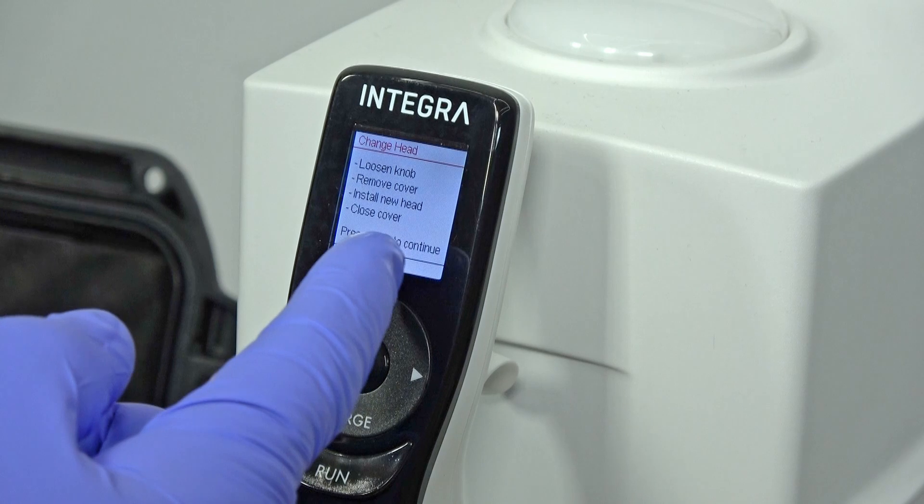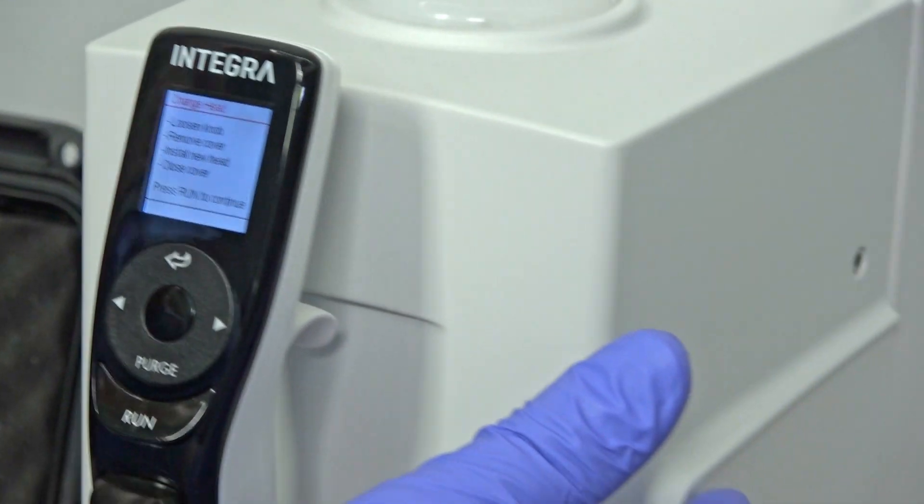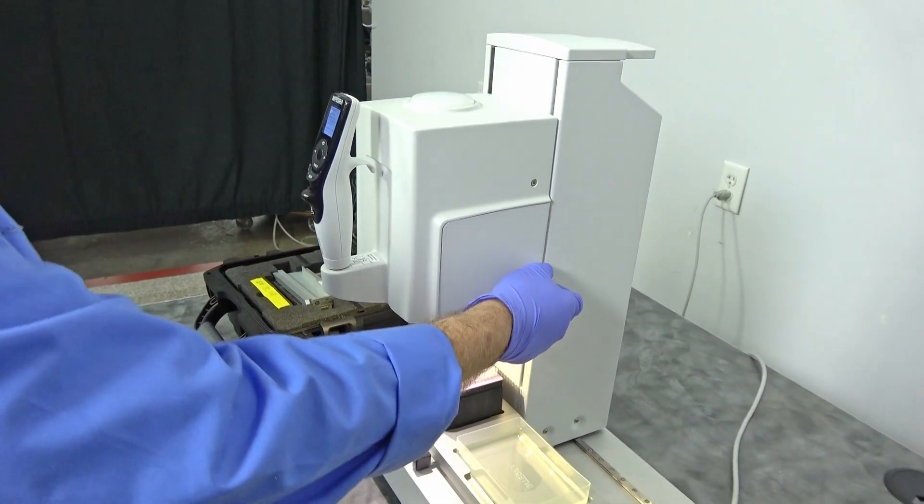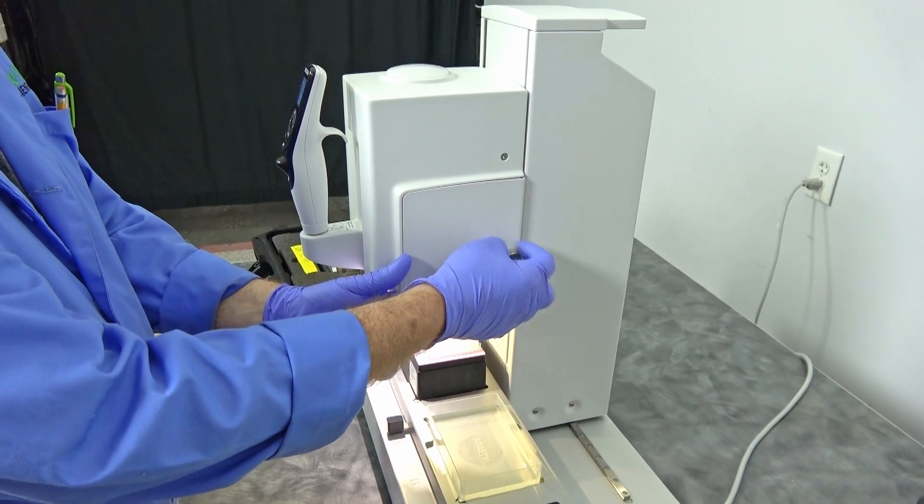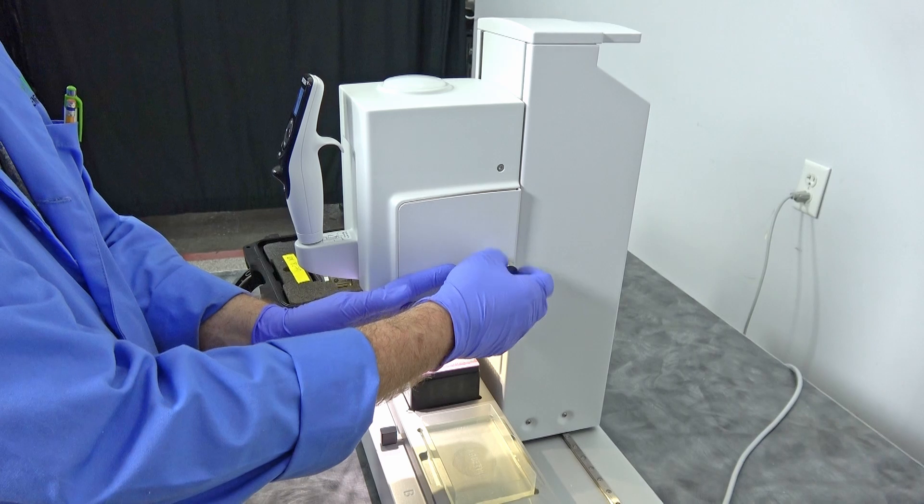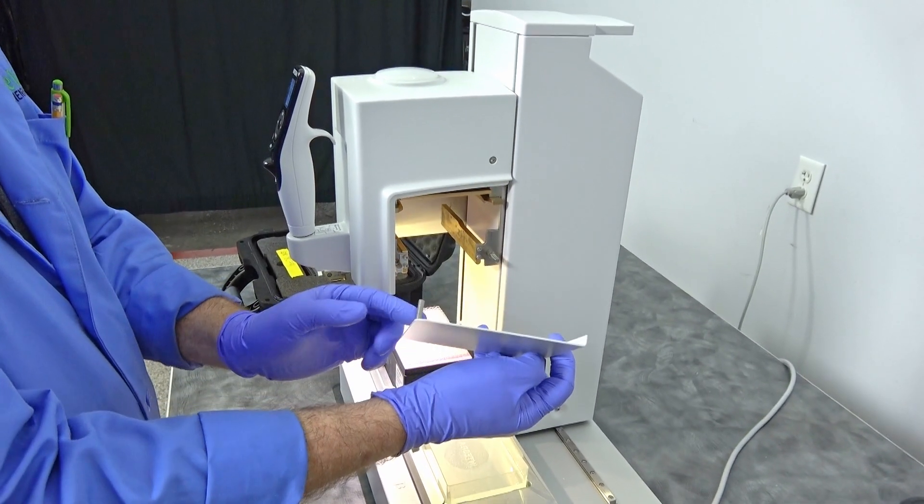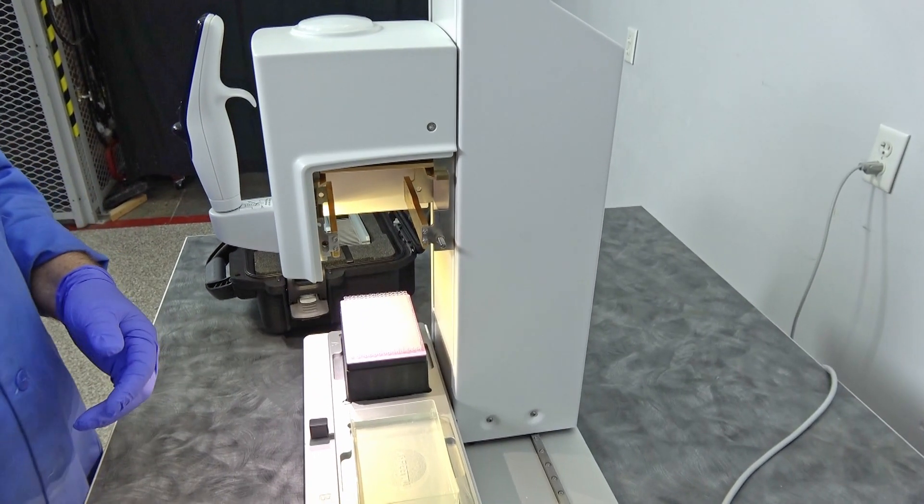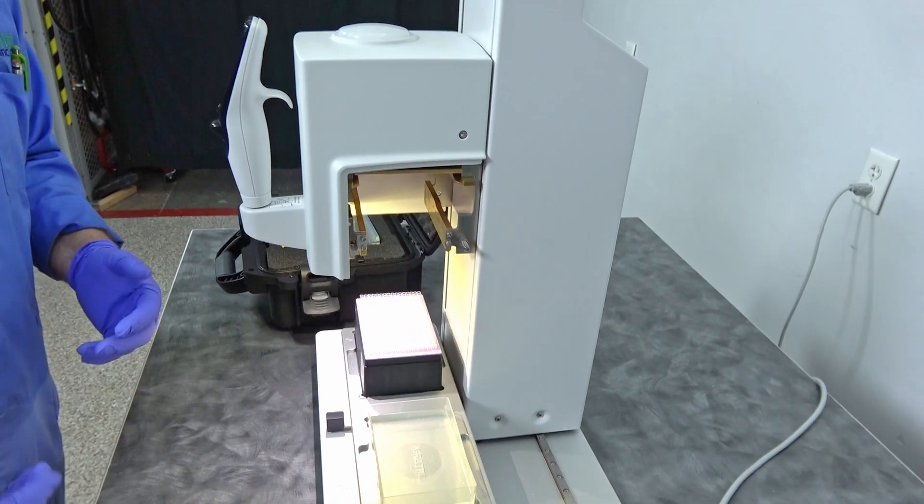So over here, you can see that the cover is on the side here. Knob's on the side, big knob, you can't miss it. So like it says, loosen knob. I'm just kind of holding it there. It does have this little pin that slides right out of that little channel there. We're just going to lay this down and it's ready to slide our head right in here.